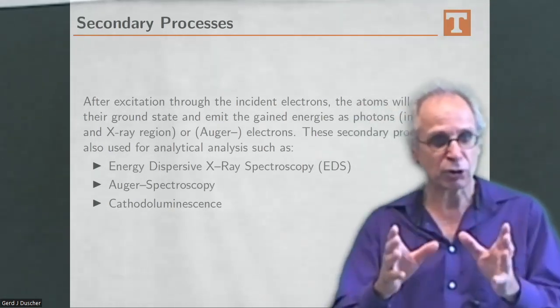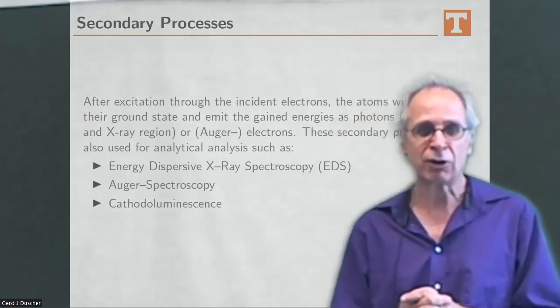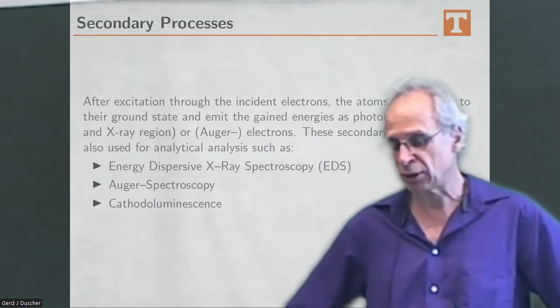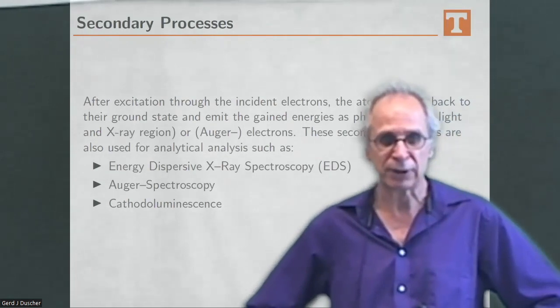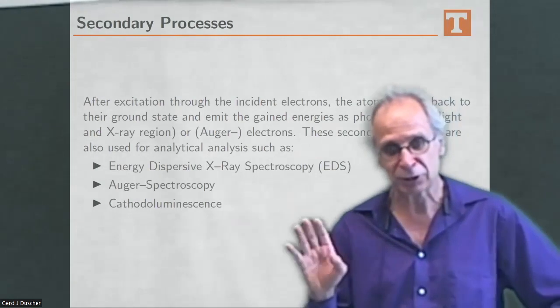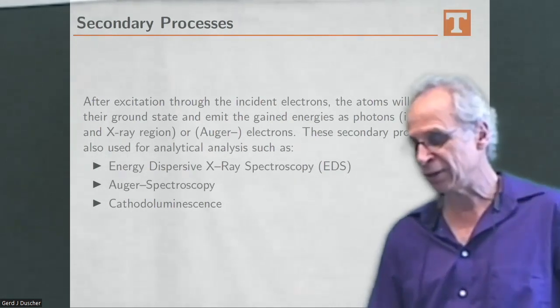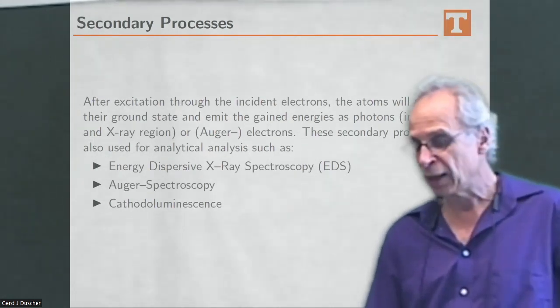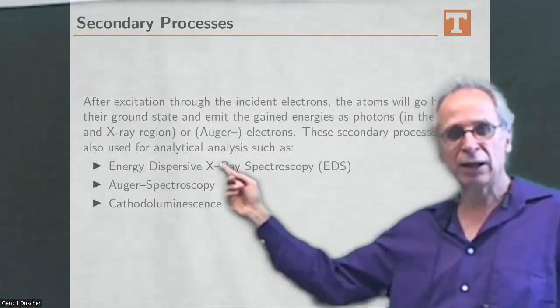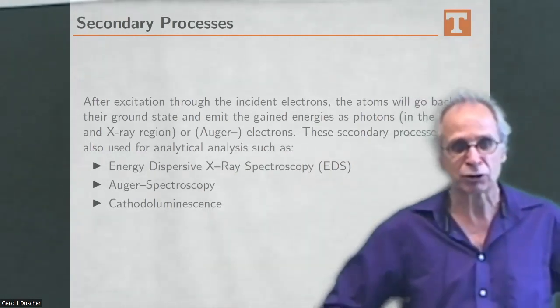But if you do it with optics, you have a laser, a high amount of photons are hitting this sample and have all kinds of effects through that. This does not happen in an electron microscope under normal conditions. So the dynamic TEM is a bit different, but I'm talking about the normal one. And then you have to run it in STEM mode, no dynamic TEM can do that so far, I think. Anyway, so it has to fall back and it gives out the X-ray, and we can look at the energy of that. So energy dispersive X-ray spectroscopy.